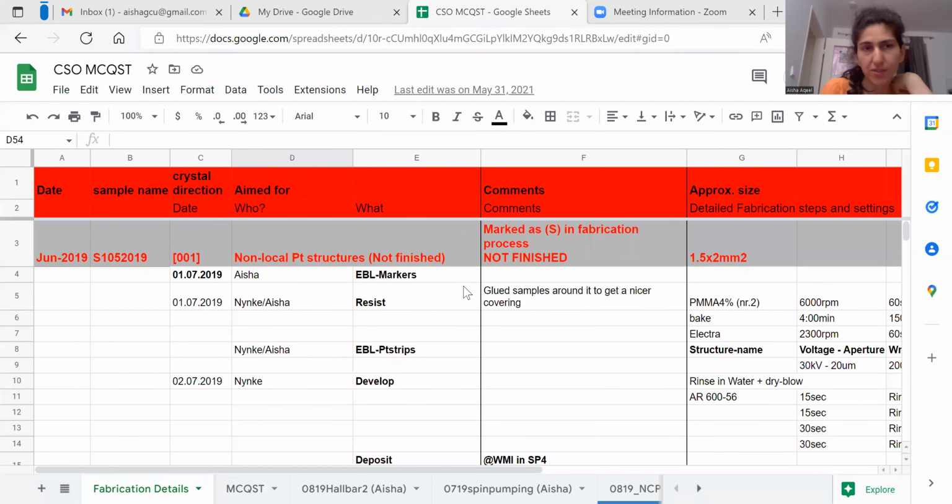So the first thing I would like to show you, which I use very often, is Google Excel sheets. Usually I save them in Google Drive. One example is here. If you are using equipment with a lot of parameters, you can put the date when you started the experiment, what sample you used, and any important information.